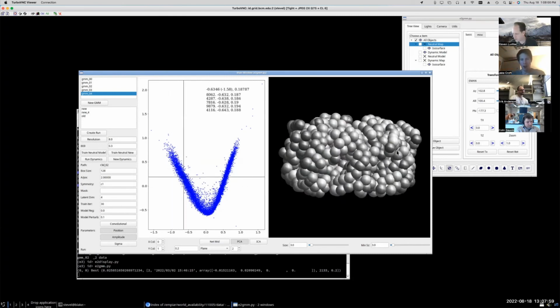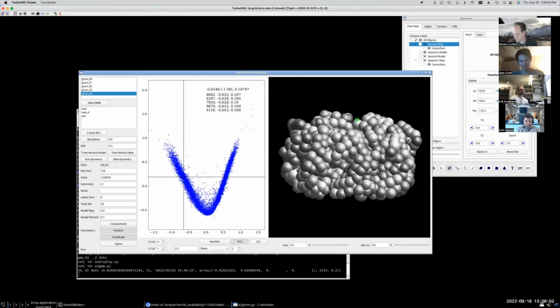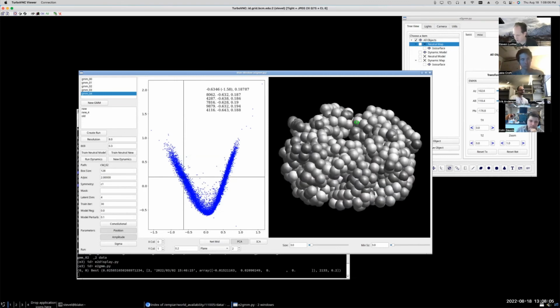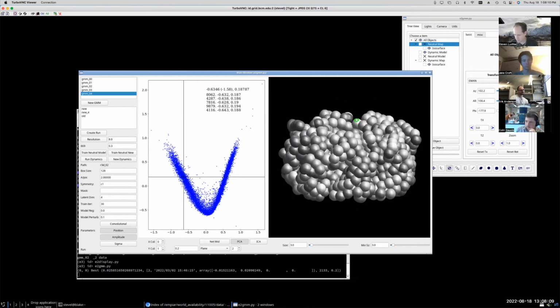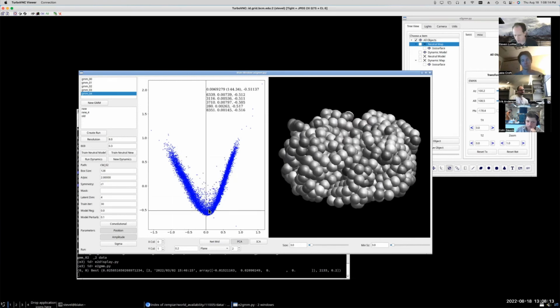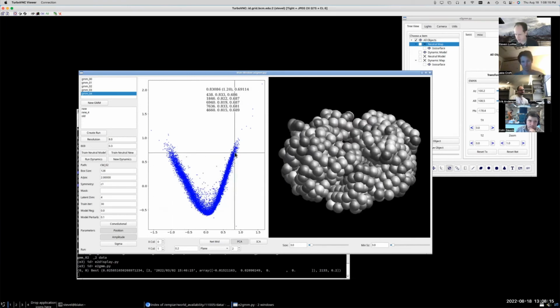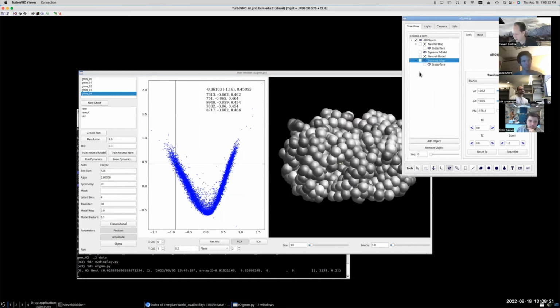The color of the Gaussians is a representation of the intensity of the amplitude of the Gaussians, although that doesn't get represented very effectively in many cases. All right, so now that we see that this looks like an interesting motion, what we can do is turn on the dynamic map. It'll come back in a minute. Actually, I'll turn it off for now. It'll turn on by itself.